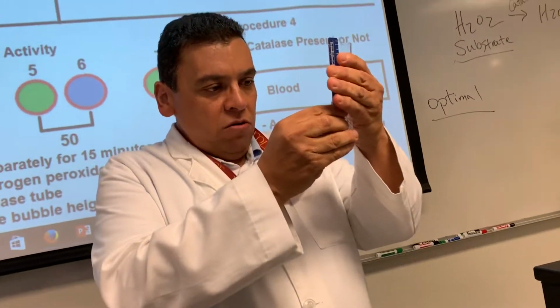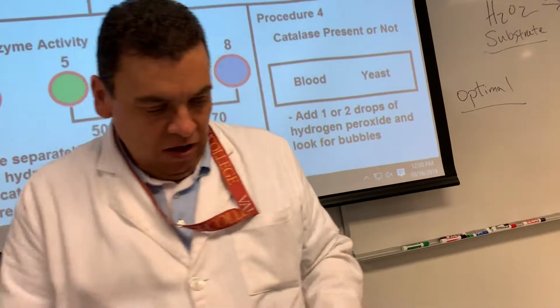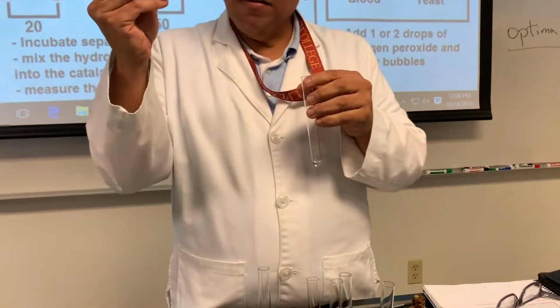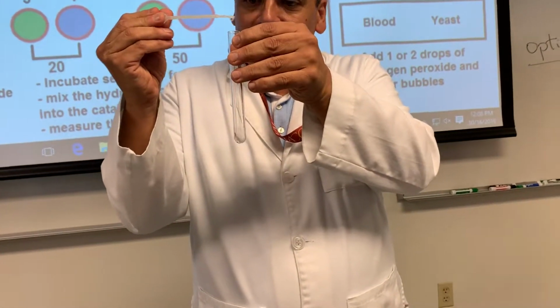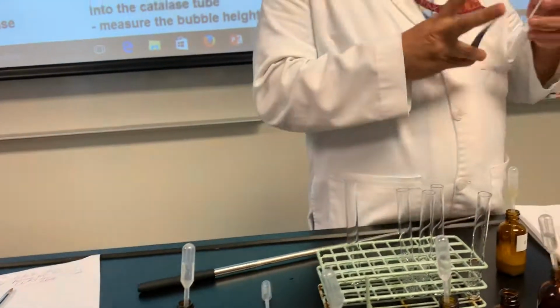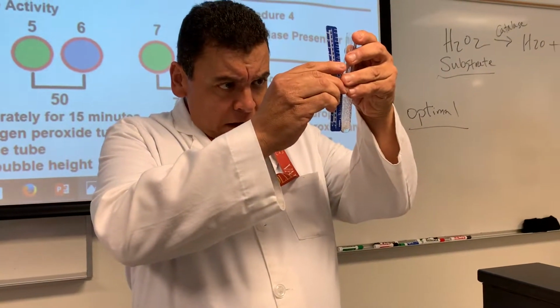Let's go to 60. Thank you. Oh, catch it. There we go. This is pH of 9. And that one went back down to 49.